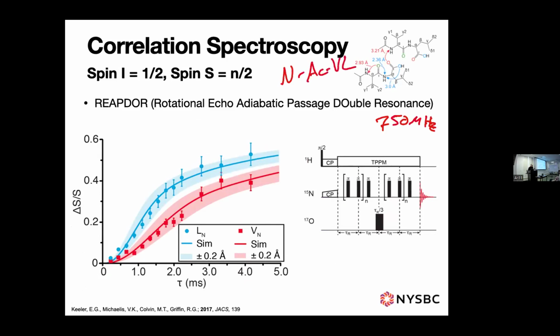That was labeled 70% with oxygen-17, and uniformly labeled in carbon and nitrogen. So this experiment is just like a regular REDOR experiment. The curve just looks like a regular REDOR experiment. Instead of just a pi pulse, you have a 1/3 rotor period length pulse on the oxygen in place of that, to better refocus that quadrupolar nucleus.